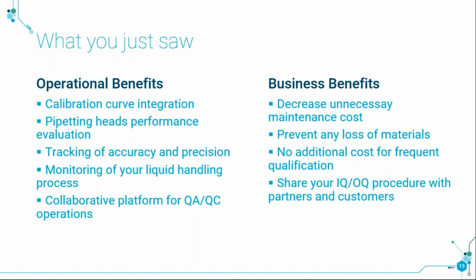And since we are working as a team, well, I can easily share my QA/QC operations with my colleagues because, well, I'm in charge of the Agilent Bravo and other platforms, but I may have another colleague in charge of the Echo or maybe other liquid handlers.